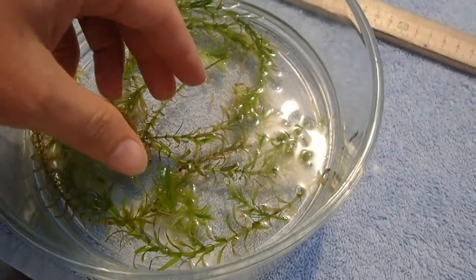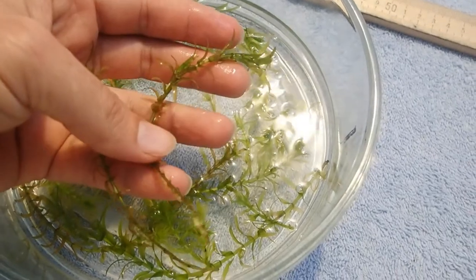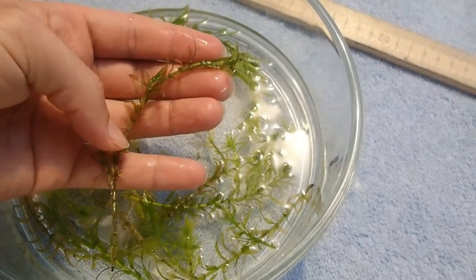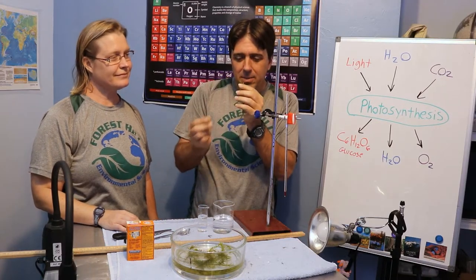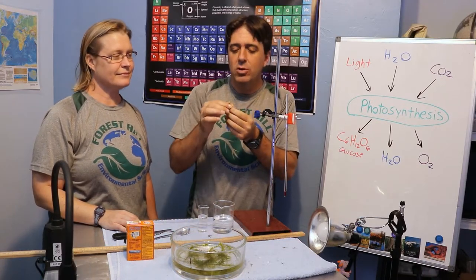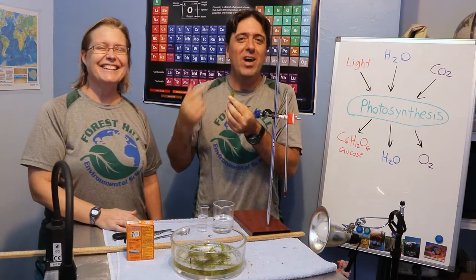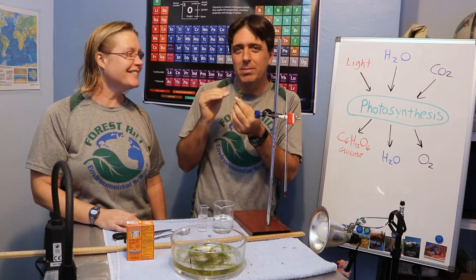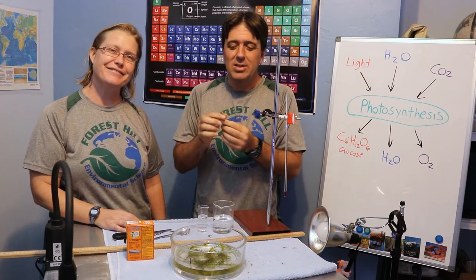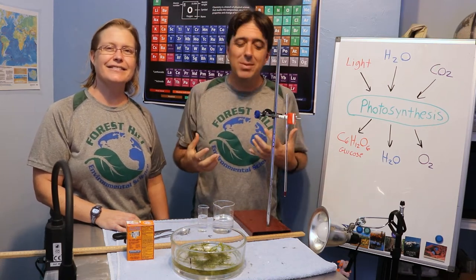Over here we have what we call Elodea, which is a common freshwater plant you can find in most rivers and lakes. What we're going to do is snap its stem and measure the rate of bubbles that come out of the stem. The faster the bubbles come out, the faster the rate of photosynthesis. The slower the bubbles, the slower the rate — so that gives us a general measure of what's going on inside the plant.